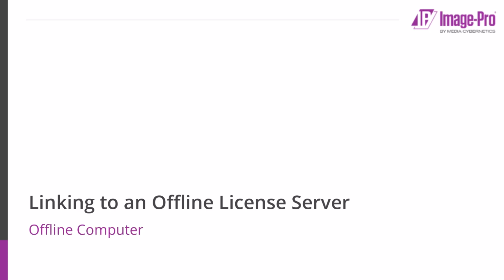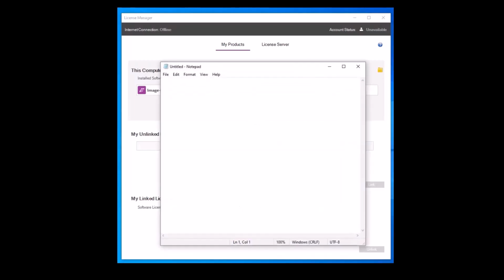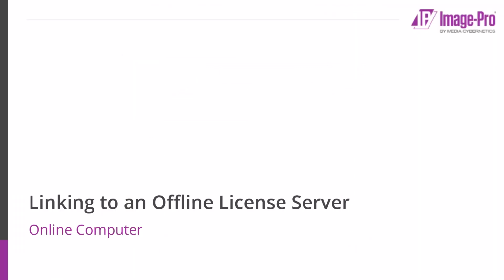The first step is to access the license manager on the offline computer that's hosting the license server. By moving your cursor over This Computer icon, a tooltip is displayed showing the MAC address. By clicking on the MAC address, it's copied to the clipboard. It can be pasted into a text document that can be moved to the online computer. The next step is done on the online computer.